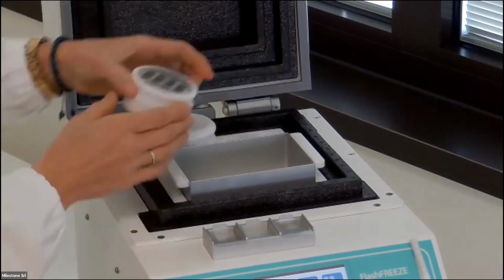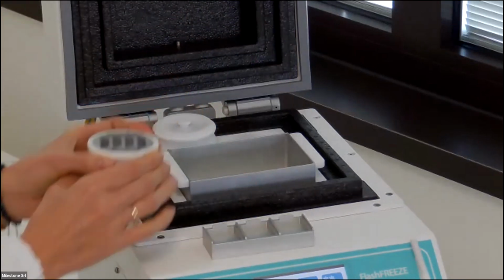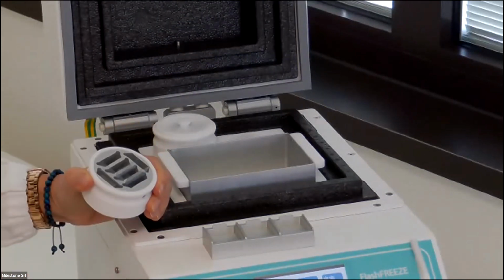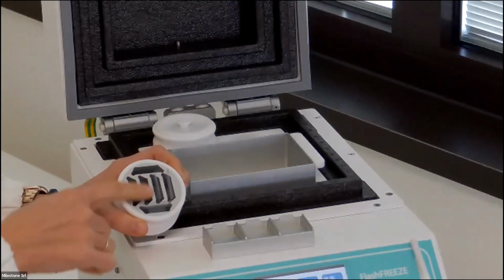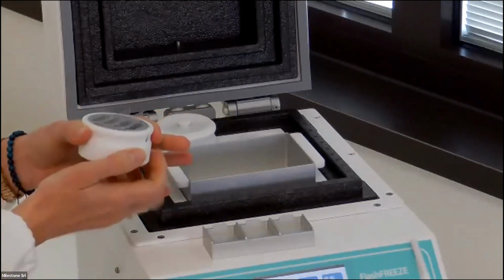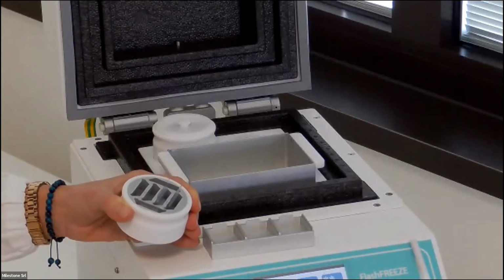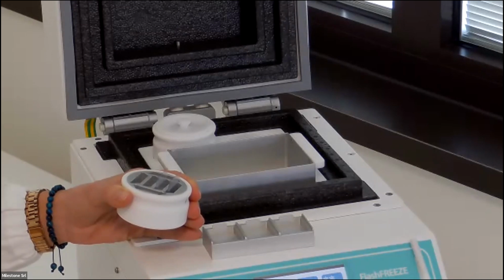Then these cryomolds, maybe up to 6 cryomolds, can be moved to the biobank freezer. This tool allows you to keep the sample at -80 for a few minutes because this metal part keeps the temperature, while it has this plastic part that avoids burning your hands. Of course, you need to use this tool with gloves, but that's normal. But anyway, the plastic insulates the cold better for your hands.